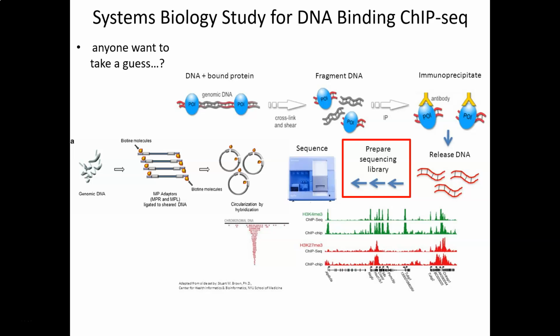So essentially what we do here is we take each of these individual DNA molecules that was immunoprecipitated and clone them individually into vectors, into plasmids. Same general way that we talked about before. Some technical differences, but none worth noting. So now we have a collection of plasmids, each of which contains DNA that was immunoprecipitated by our protein of interest. That's our sequencing library.